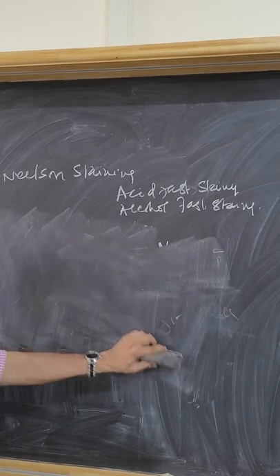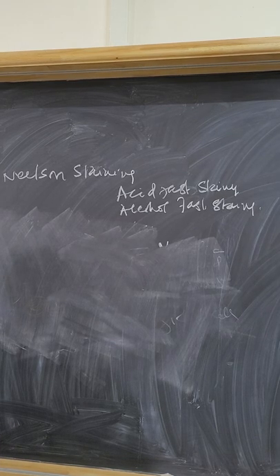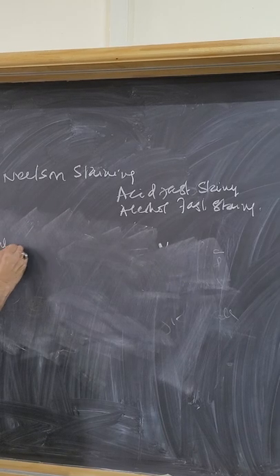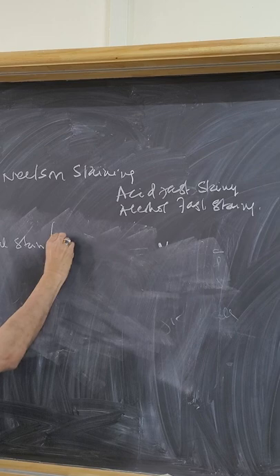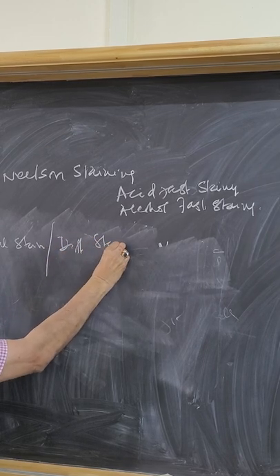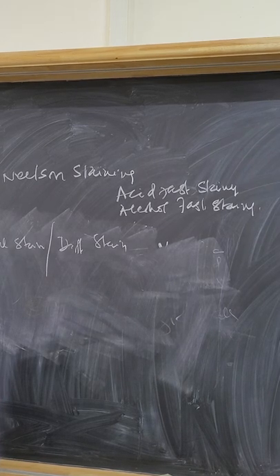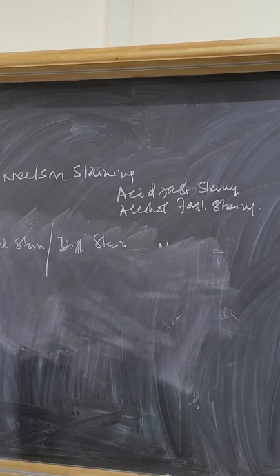So, yes. Ziehl-Neelsen technique is a special stain as well as a differential stain. It is called a special stain because it stains the special character of Mycobacterium tuberculosis, that is acid fastness. It is also called a differential stain because it differentiates between acid fast and non-acid fast organisms.